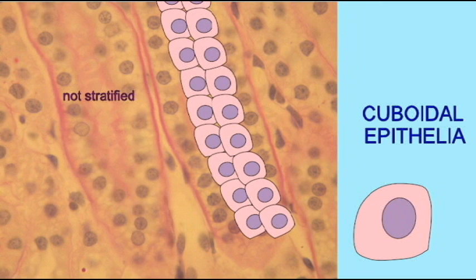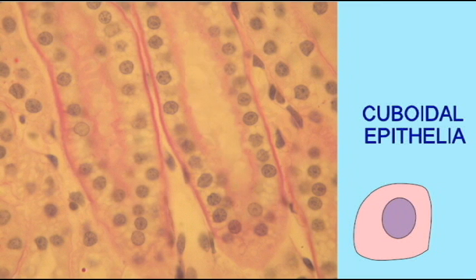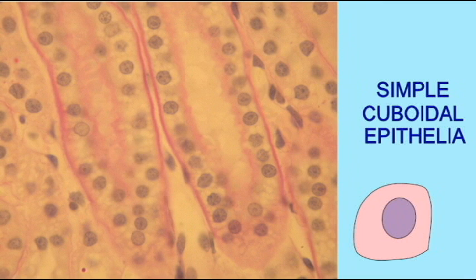This is a simple epithelium. There is only one layer of these simple cuboidal cells. It is not stratified because there are not multiple layers of these cells. So this is an example of simple cuboidal epithelia.